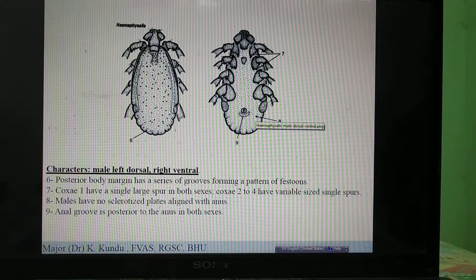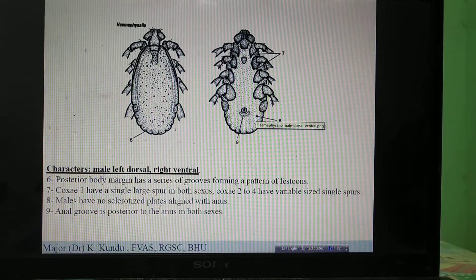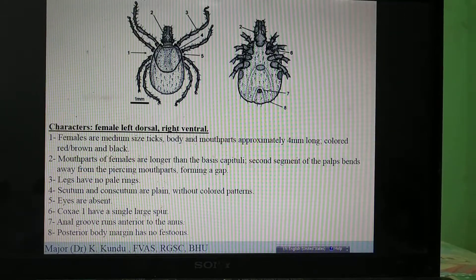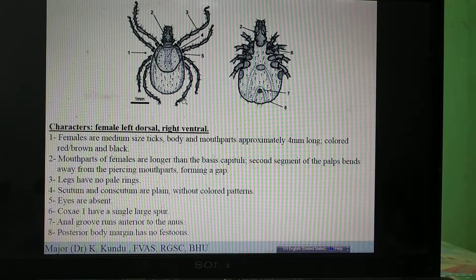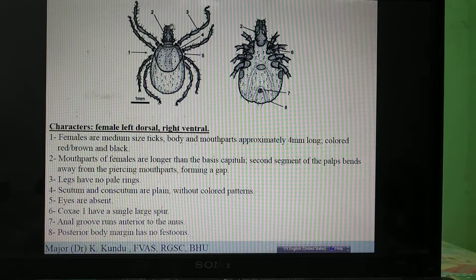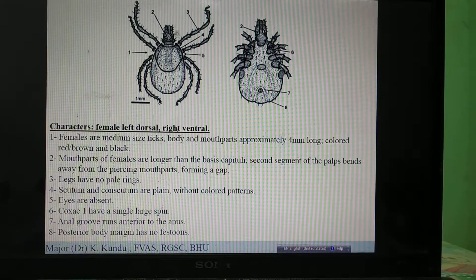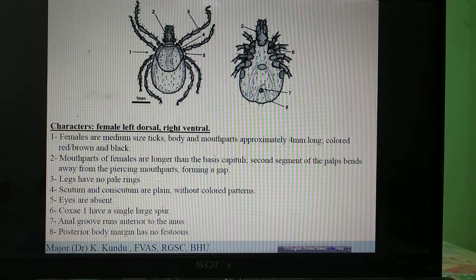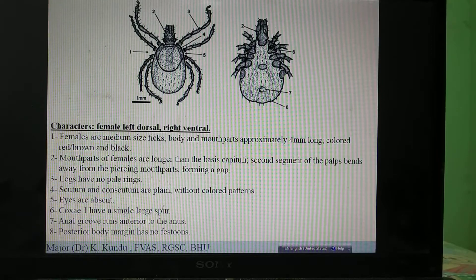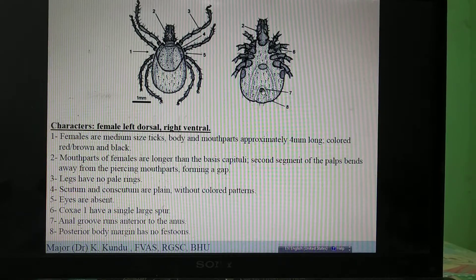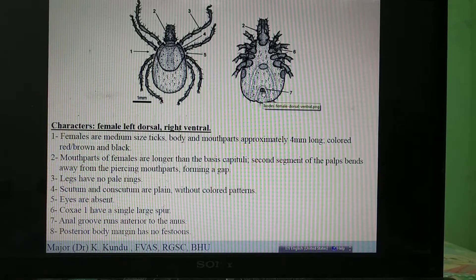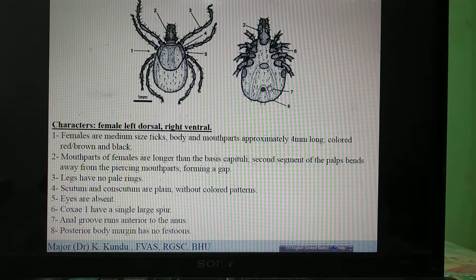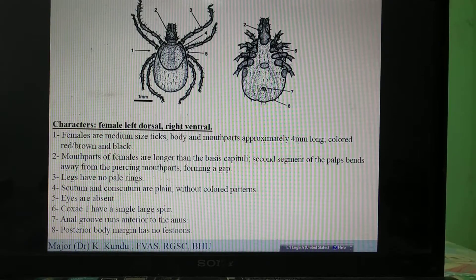Now coming to Ixodes — another important genus. Ixodes are longirostrate ticks. There is a strong spur on the first coxa, but the most important identifying feature of Ixodes — which you can recognize immediately without looking at any other structure — is the anal groove. The anal groove is anterior to the anus, so it has an anterior anal groove.